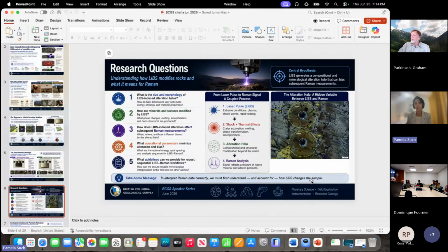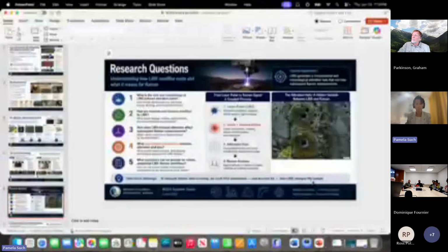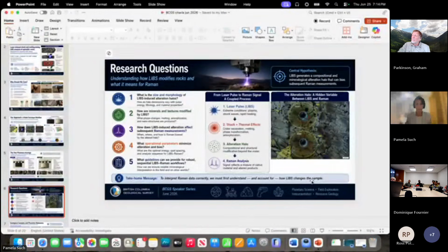So we can analyze these meteorites in an atomic force microscope in the nanoscale. So we analyze the matrix, for example, of the meteorite and some of the chondrules, if it has chondrules, or some of the carbonatic veins, if they have them. So we analyze it and then we extrapolate this to the macro scale with the satellite that is flying and acquiring the data. We can work in between scales as well.